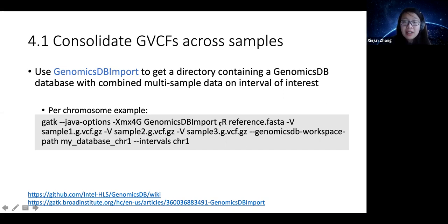And again, in this part, we can specify our intervals. You can specify multiple chromosomes here, or most of the time, what is helpful is we actually call VCFs per chromosome. So we can later on join all of these chromosomes together and have a whole genome file. But depending on what you need, a lot of times I find calling VCFs on separate chromosomes very helpful, so that if there are particular genomic regions you're interested in for your work, you can look at just those files without loading the entire whole genome VCF.